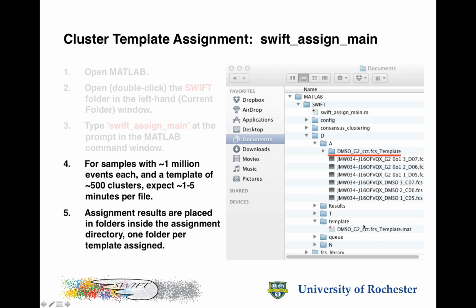If you have put more than one template into the template folder, then all samples will be assigned to all templates, and the results will be output into multiple folders of this sort within the A folder.